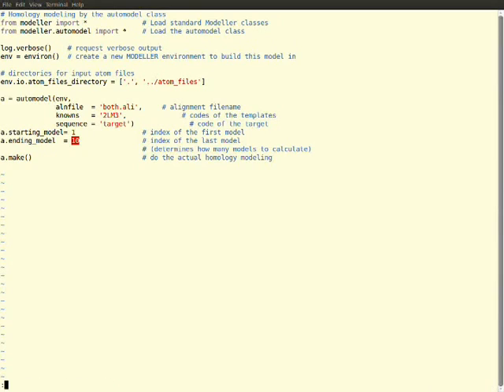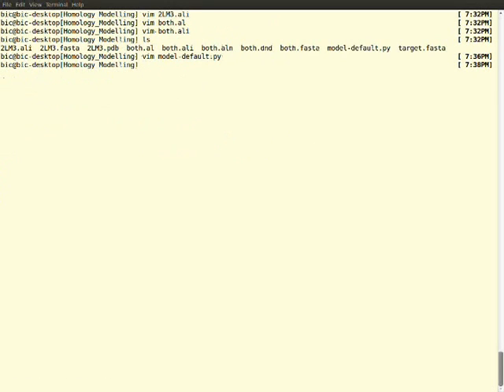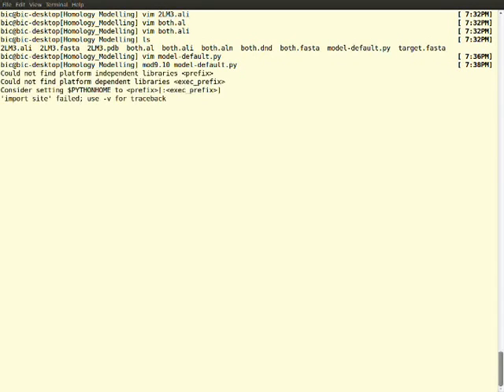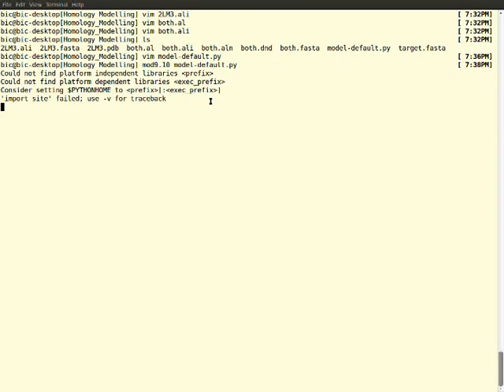Let's go into the program to execute. You want to type the command 'mod9' - my version of MODELLER is mod 9.10, and the model-default.py file. You want to note one more thing: this model-default.py file should be present in the folder which has all the input files. If the thing is blinking and you get an indication that says 'import site failed' and 'use -v for traceback', it indicates that our homology modeling is running. We will get a log file as output. If you analyze the log file, we can know which is the best model generated. It will take time. It hardly took around 5 minutes to complete my model since my amino acid residues are very few.